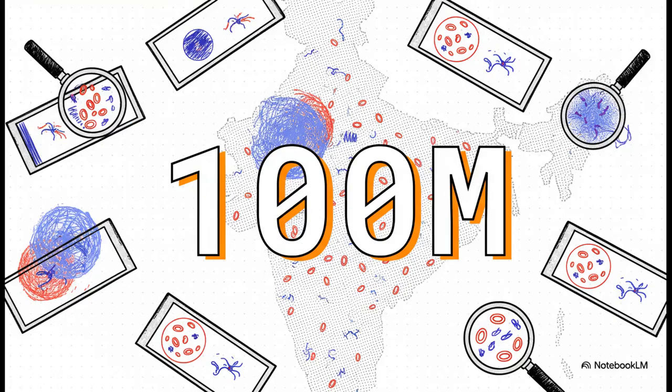I mean, the scale of this operation is just staggering. To keep that crucial API metric accurate and to control malaria, India alone screens roughly 100 million blood slides every single year. That's 100 million individual forensic investigations, all done one microscopic detective at a time.